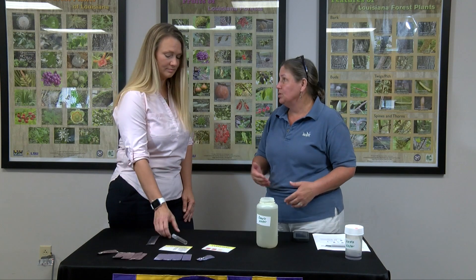Our next test is for nitrate. We're going to take our water sample and measure for nitrate in the water, which is another nutrient for plants. We'll take a test tube and put five milliliters of water in it.